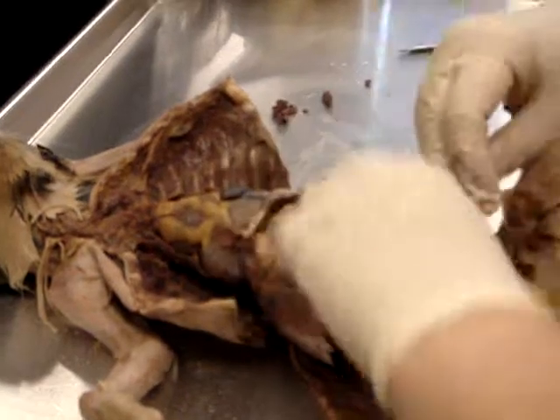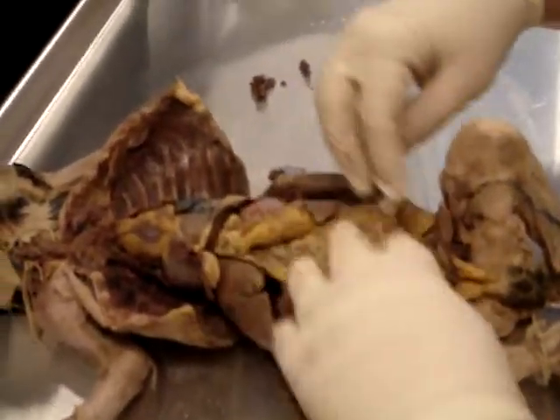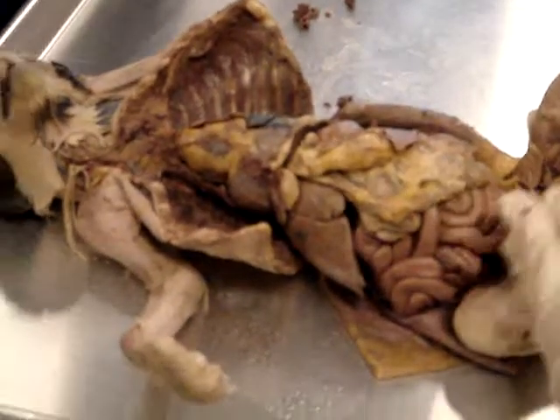One of the other very first things that you'll see is what looks like a rather large sheet of fat that is sitting across the abdomen.